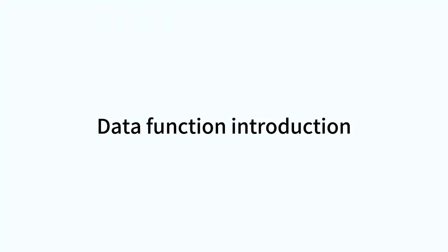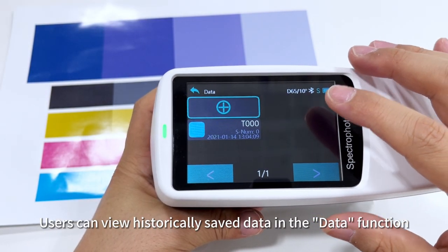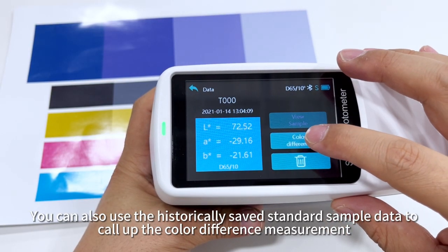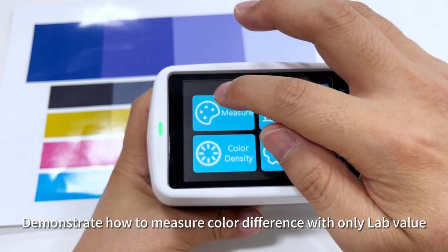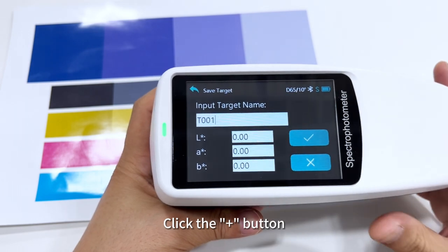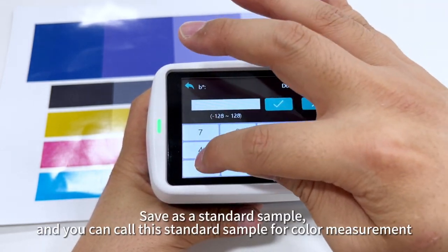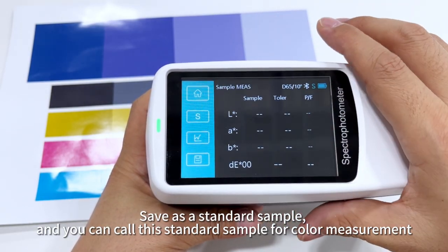Data function introduction. Users can view historically saved data in the data function. You can also use the historically saved standard sample data to call up the color difference measurement. Demonstrate how to measure color difference with only LAB values. Click the plus button. LAB values can be manually entered. Save as a standard sample, and you can call this standard sample for color measurement.